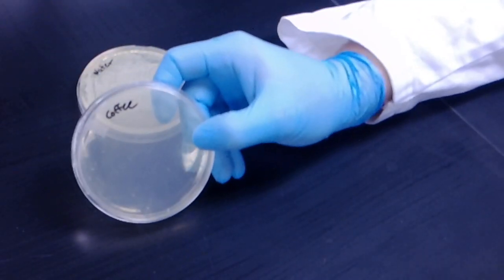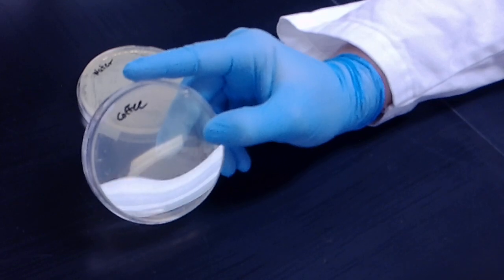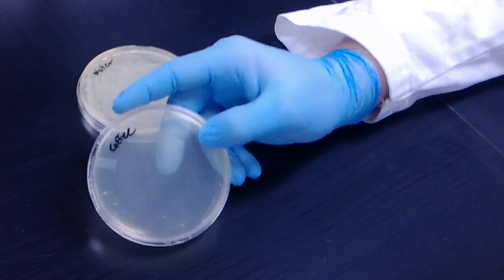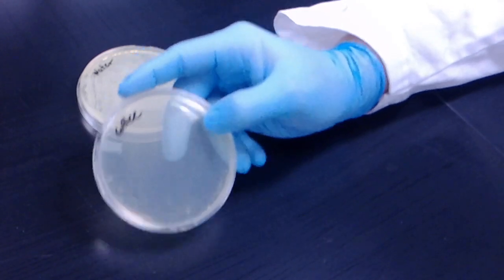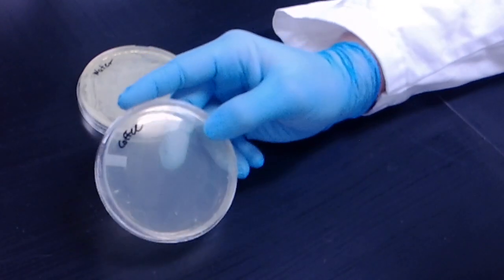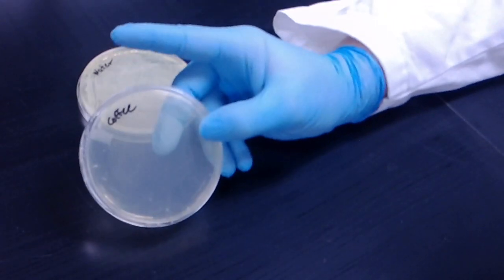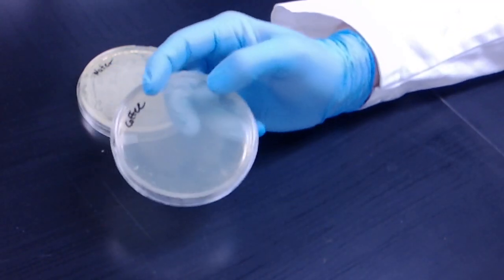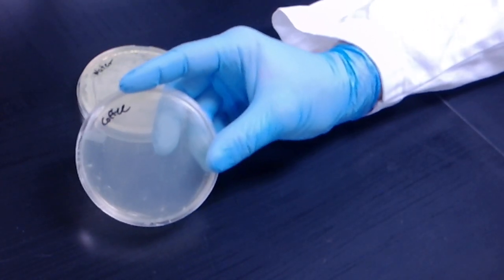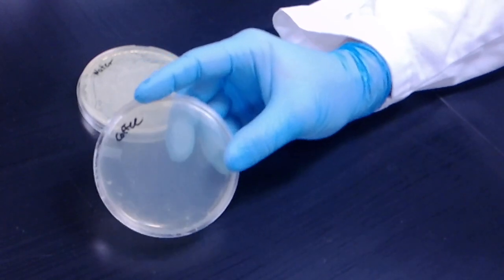Now this is something that we were expecting to see a lot more of. So this is an interesting result. It could have been that the main possibility in this plate is that maybe this TSA plate didn't have the correct nutrients to supply to whatever microbes were growing in the coffee. So when we plated this, we saw a thin biofilm of microbes. So this just shows that there were probably microbes in the coffee, or I'd almost bet my $5 in my pocket that there were. However, these were not optimal growth conditions for the microbes that we had on TSA plates at 37 degrees Celsius.